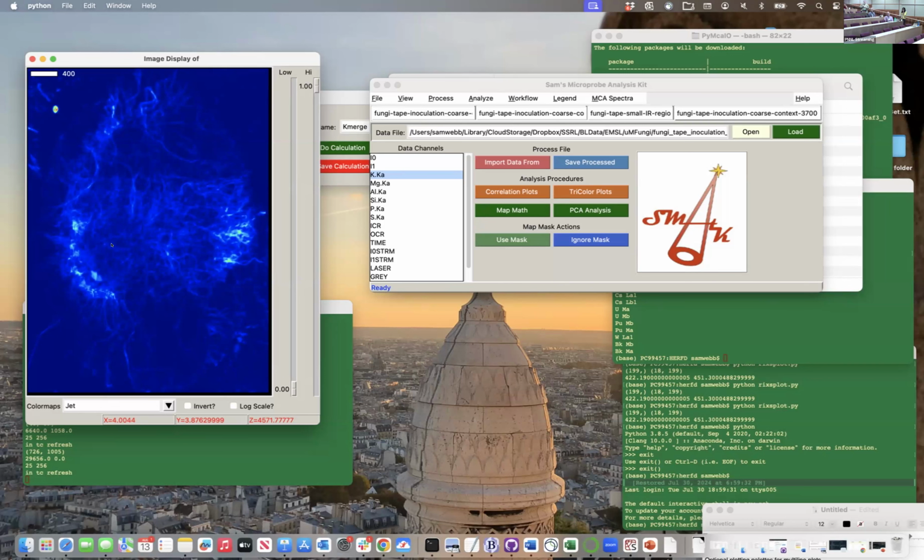This is the problem that we're getting at right now, that we're developing faster than I can document, which is a fun thing for me because I thought, oh, this is really cool. Even people in my group are like, oh, I wish I could do that. Oh, I did that a month ago. And they're like, what? So it is going faster than even I can document. We're trying to catch up this summertime. So hopefully you'll see some more documentation coming out.